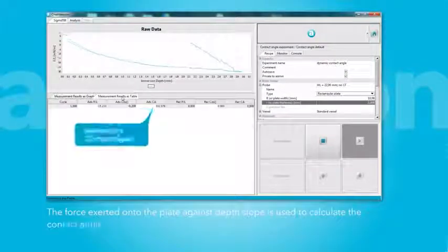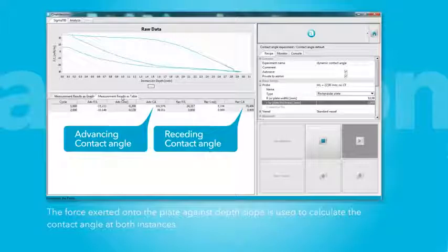The force on the plate plotted against depth provides a slope that is used to calculate the contact angle in both cases.